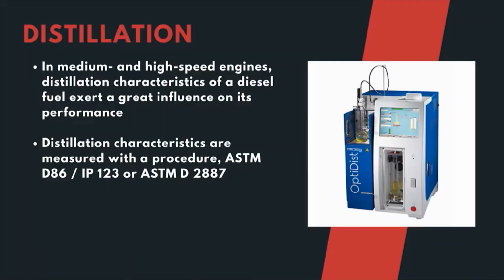For example, cloud point and cold filter plugging point are commonly used in fuel testing, while freezing point is tested in the aviation fuel industry. So, for aviation fuel, the important test is its freezing point, because the flights will be operating at an altitude of 35,000 feet. At that particular elevation, the aviation turbine fuel should not get frozen. And the pour point is a specific test for new or used lubricants or greases.